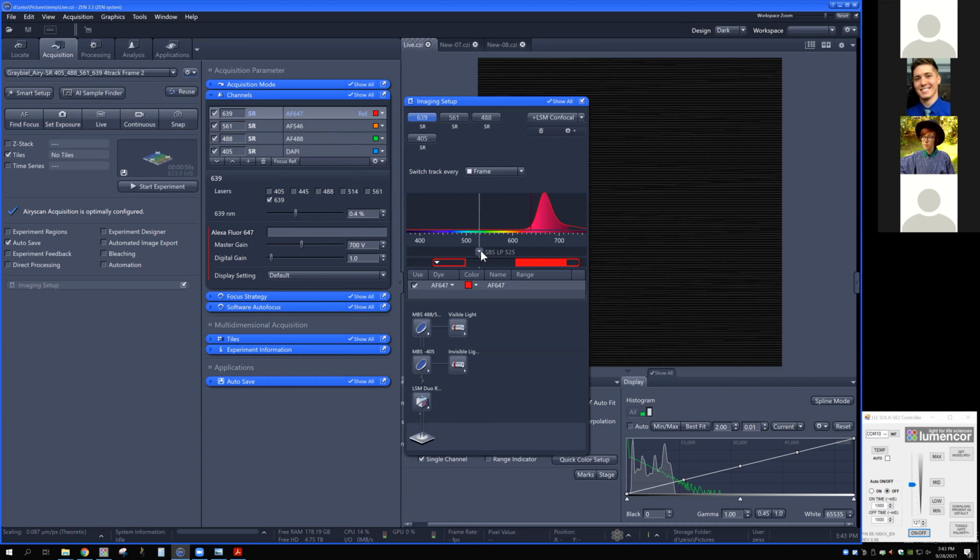It's a bit like a puzzle box, I suppose, as you work with these different combinations to piece things together. The range that matters is the range that's colored down here. And so even if you have something that looks like it might be getting the wrong channel, if it's not lit up, then it doesn't really matter, because it's the combination of these two that really dictates what you're going to end up getting in terms of emission signal in the end.